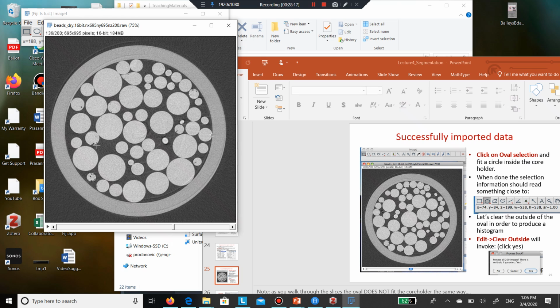Now, if you want to perfectly model it as a bead, well, it's not a perfect bead, right? If you want to remove that defect, this is a real one, okay? This is not real. This is a ring artifact. So some of these things are real and they're not perfect, but they're realistic. That's what it is. You imaged what is. In the case of a ring artifact, you did not image what is. There's just a problem on the detector. Okay?